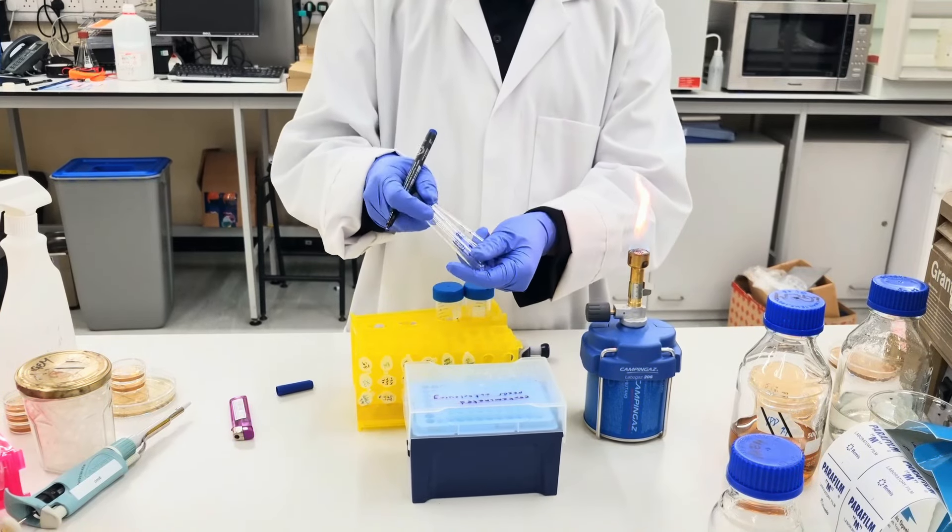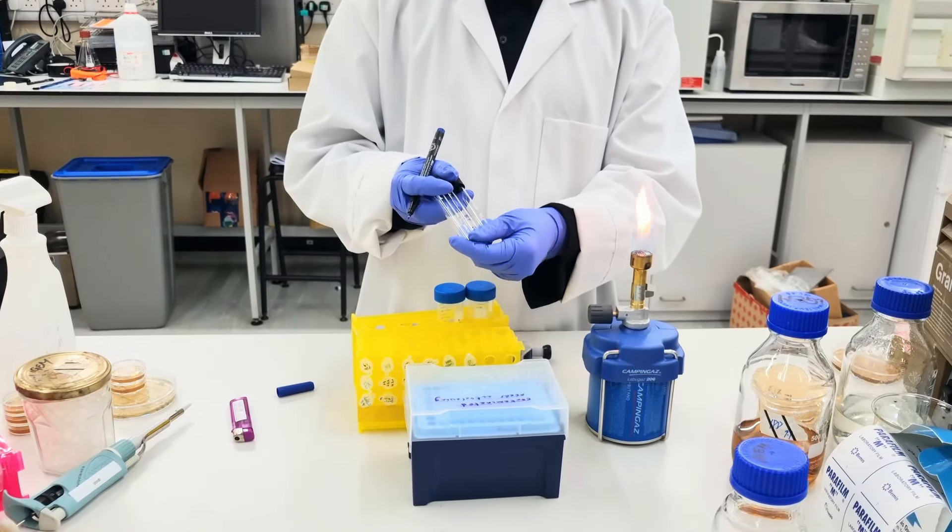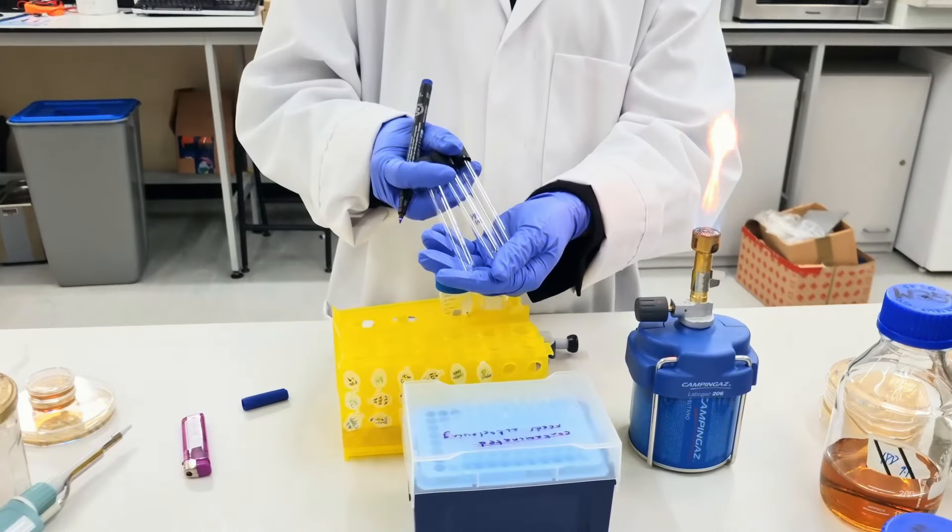So like this, label your tubes with the names of the strains you're going to inoculate and also the dates you're going to do this.